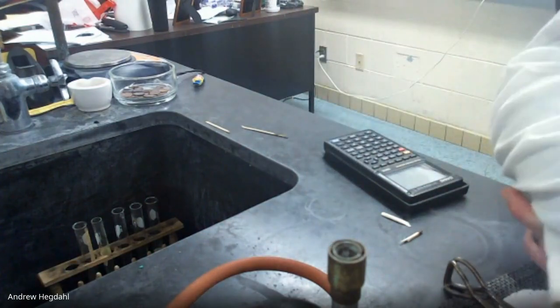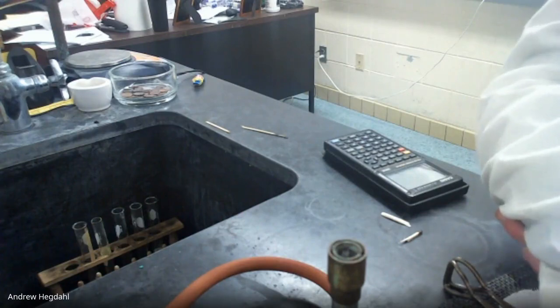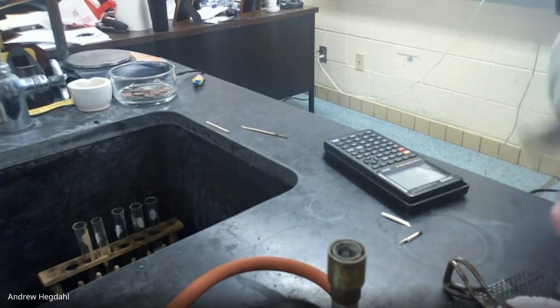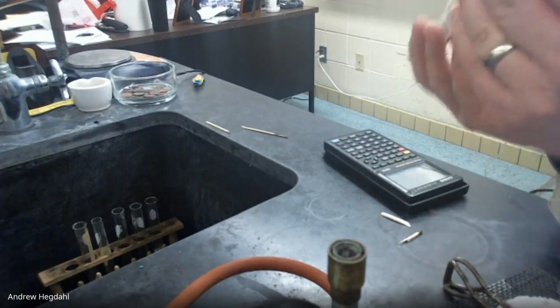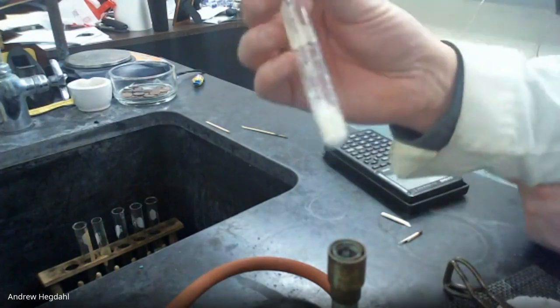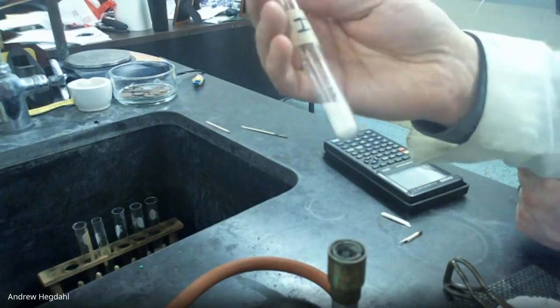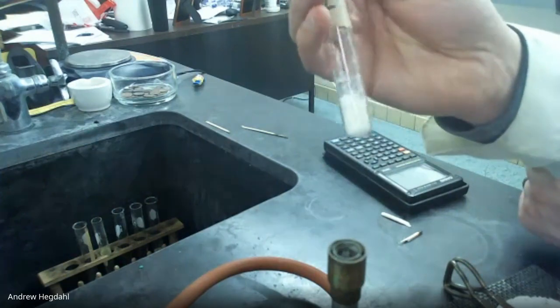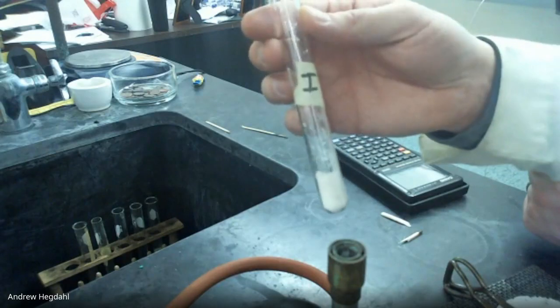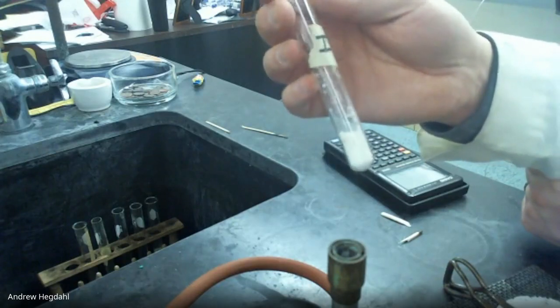All right, I've got one left to find. A, B, C, D, E, F, G, H, I. There we go. So I see kind of a gray sugar-like crystal. One of the other samples was like a normal white sugar. This one's a little gray. Looks a little like dirty sugar.